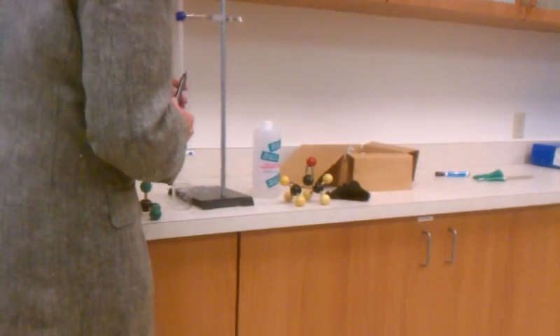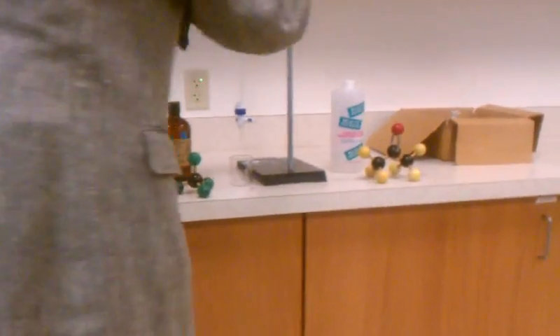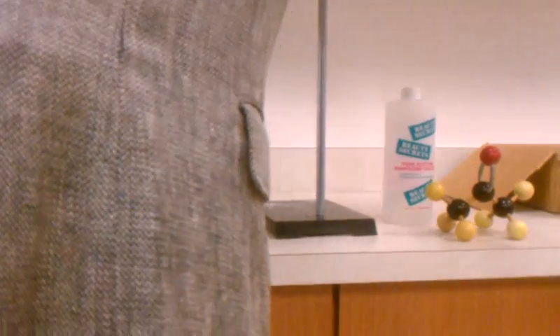Let me take my stream of acetone and try seeing what happens with it. So here's my acetone in this other burette. That feels a little loose. Okay, so here's my stream of acetone. Bring up my charged up rod. Let me raise it a little higher.